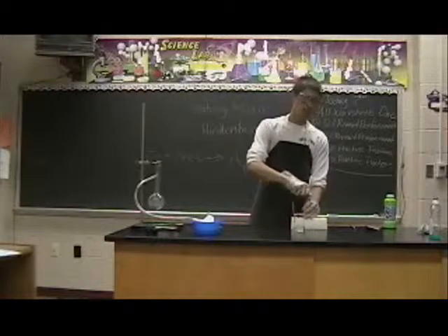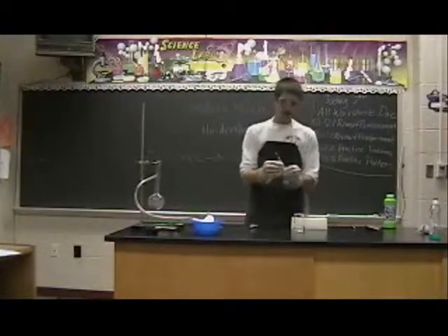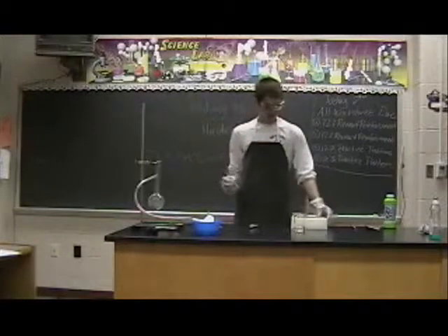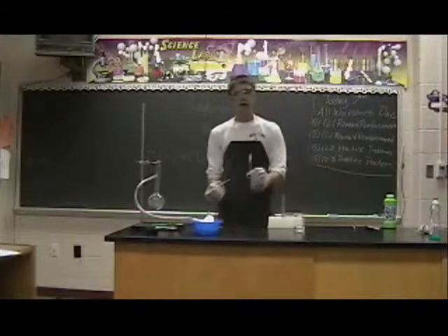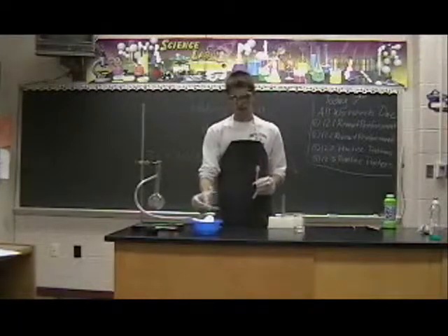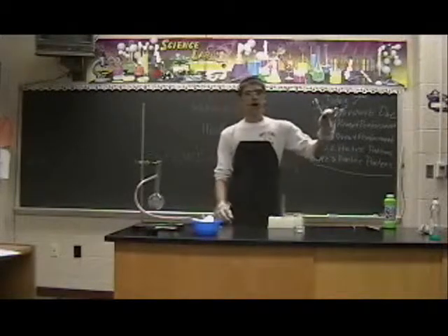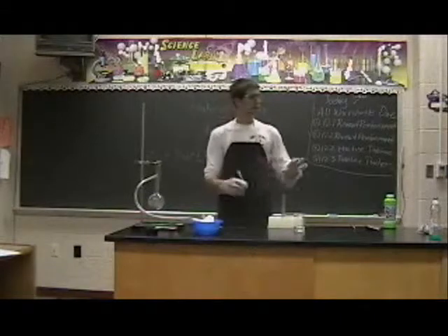First, you take the hydrochloric acid and put it in the top here. After you do that, you put this in right away and fill it up with the micro bubble solution. I have Brandon Williams here helping me with the fire.